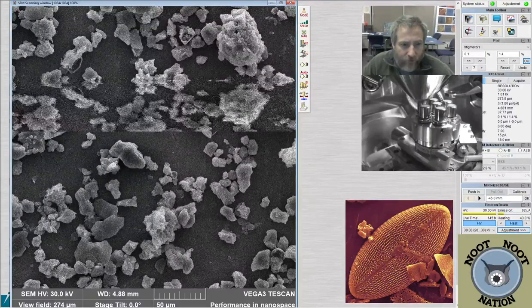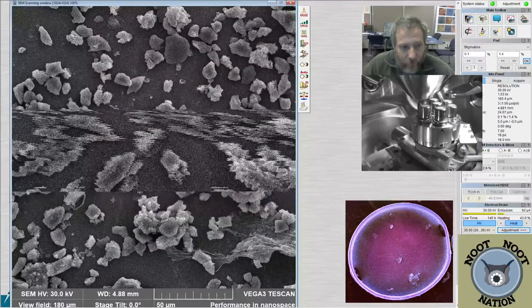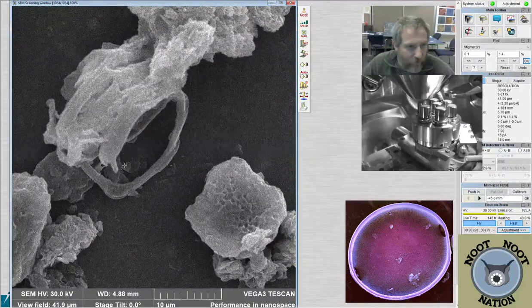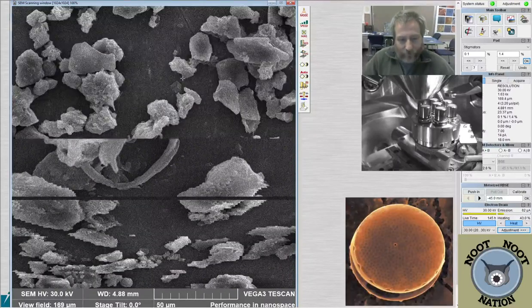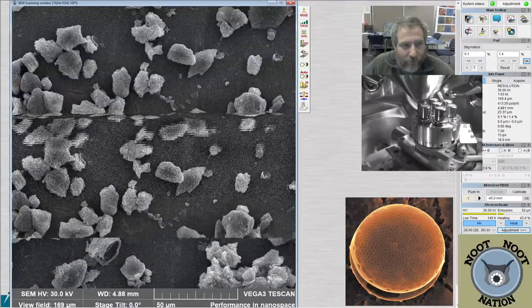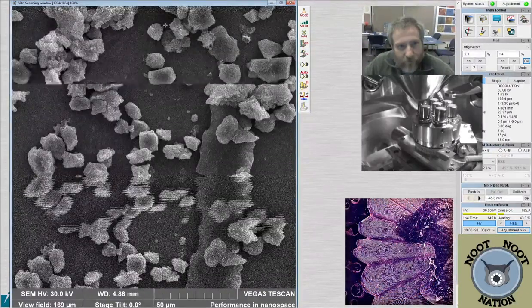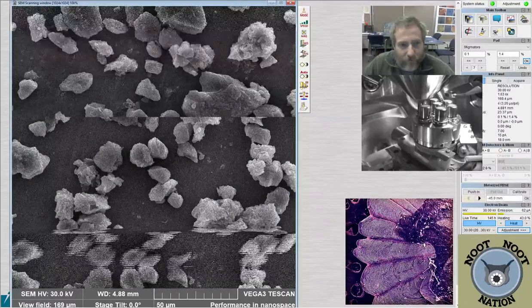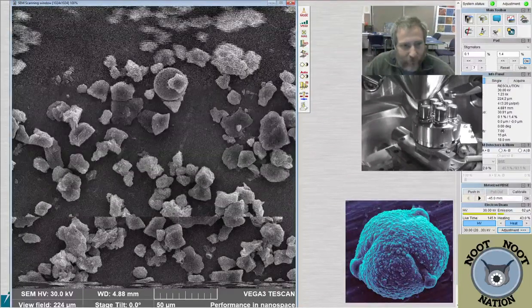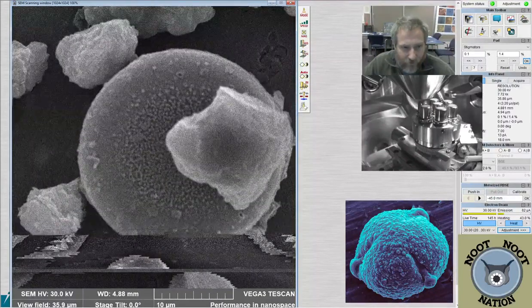One of the problems with trying to get good images on an SEM is trying to figure out at what height I should be looking for them, in terms of the elevation away from the sample. It's sometimes difficult for me to get a sense of, am I too far out? Am I missing things because I'm too far out? Because we want to move through a lot of material to find them, but if we're too far out, they'll be too small for us to see. So I kind of have to zoom in and out. And if I'm too close, it means I've got to do a lot of clicking to move up and down in the sample to get to a place where I can resolve our diatoms.